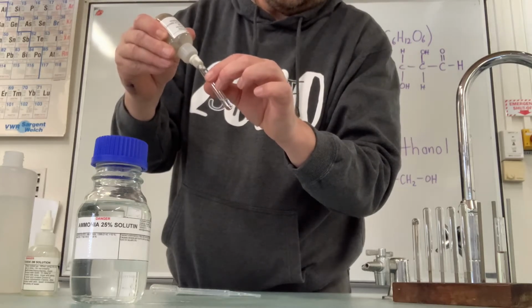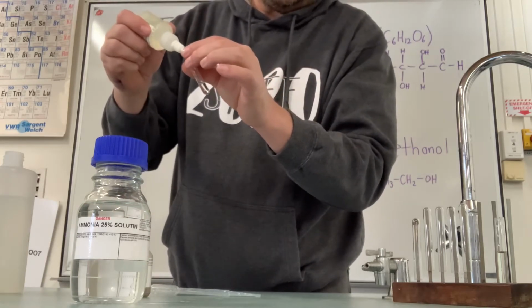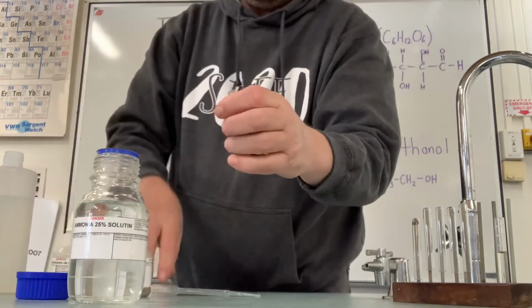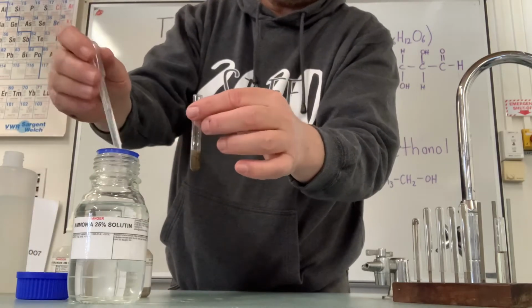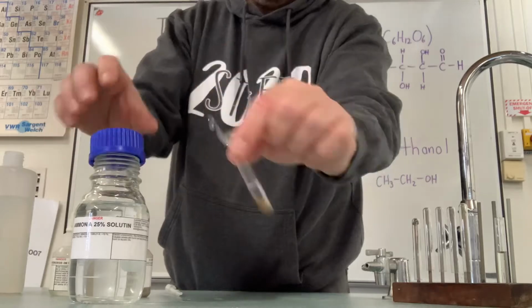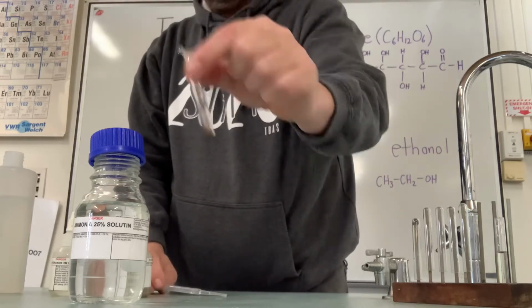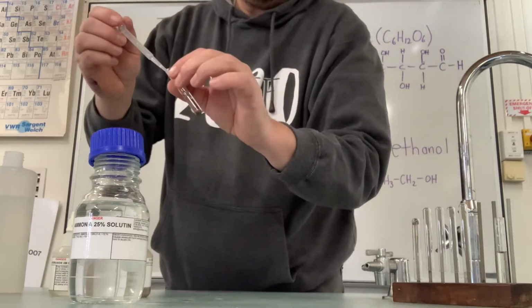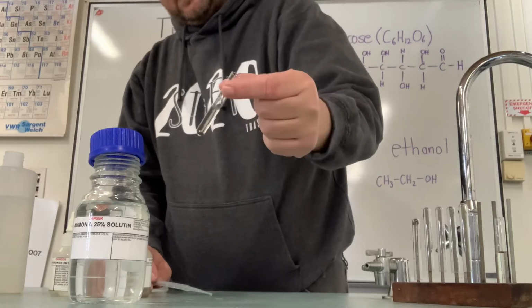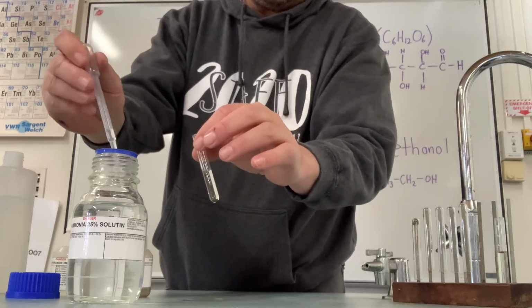So I add my silver nitrate, add my sodium hydroxide, take a deep breath before I open it, add my ammonia solution here, and shake to get that to dissolve. More. Okay. Just not quite all dissolved yet, so I'll just need a little bit more ammonia.